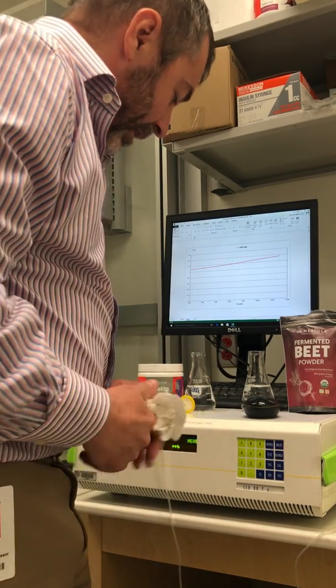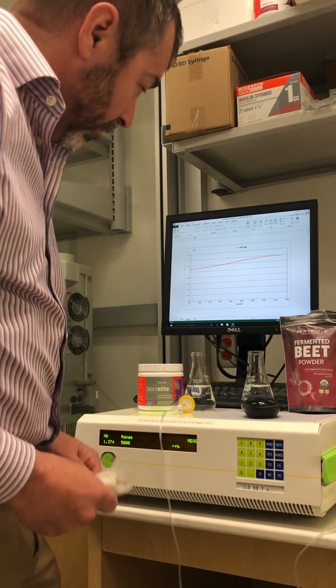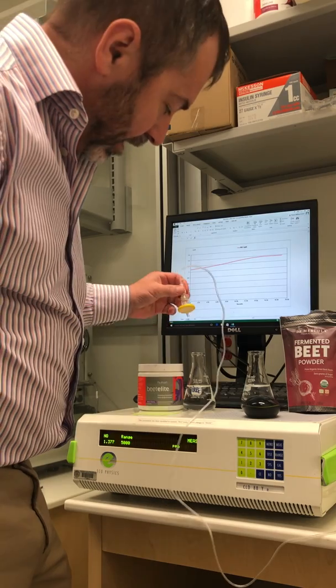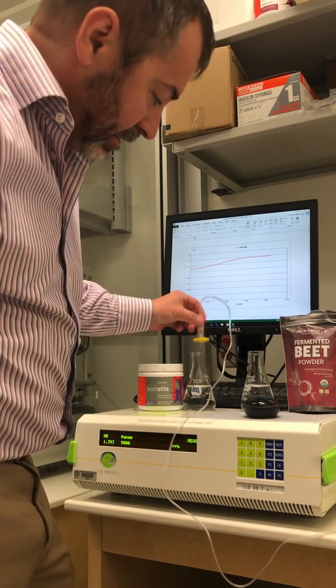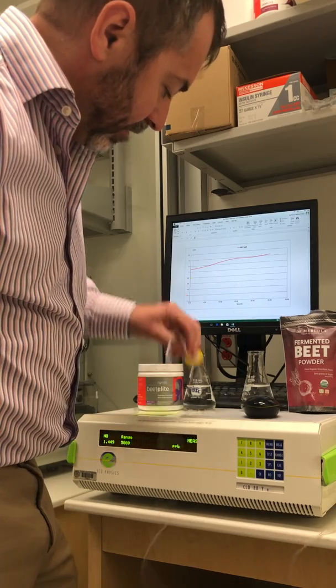I wanted to have a little fun in the lab today just to demonstrate that all beads aren't created equal. So what we have here is a nitric oxide analyzer. You can see this is just regular water — there's no nitric oxide coming off.